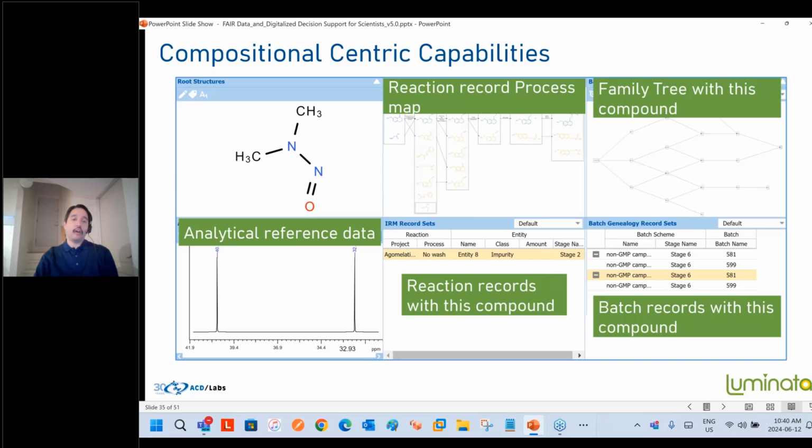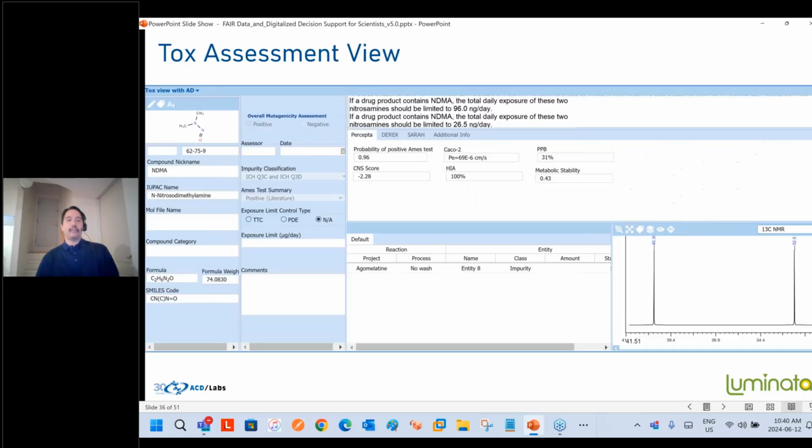Now, this may be dependent on the end user and what they're looking at, but this layout can change. So really, if I start talking to somebody more focused on the toxicological aspect of the particular compound, the layout is different. The data is still there in the lower right-hand side, but you'll see that the focus in this part is really on the metadata and also the in silico properties here. So not only are we going to see the compound name with the InChI and SMILES strings, but a quick summary and also the in silico properties that were predicted internally within our applications or externally as well too. But sharing that all within one record. Having these types of views is quite crucial for the user.